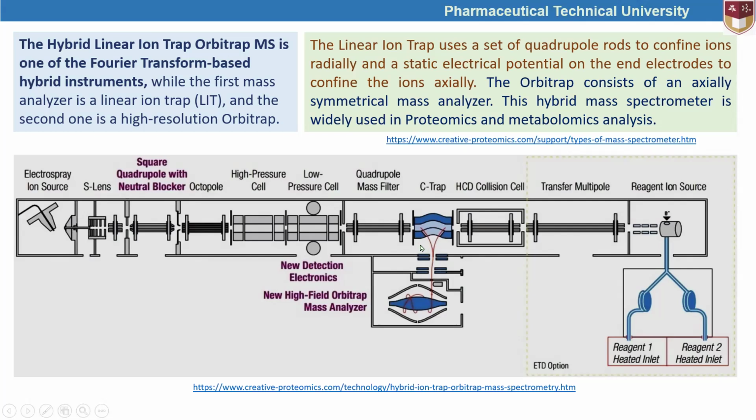Yeah, I think triple quadrupole, the first one, the second one, and the third one. Okay, quadrupole. Yeah, maybe double quadrupole. And after the quadrupole, here we can see the trap, orbitrap, and these two mass analyzers allow this tool to achieve high resolution results.